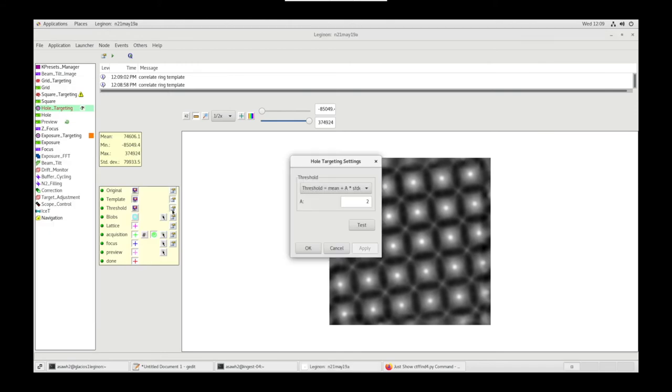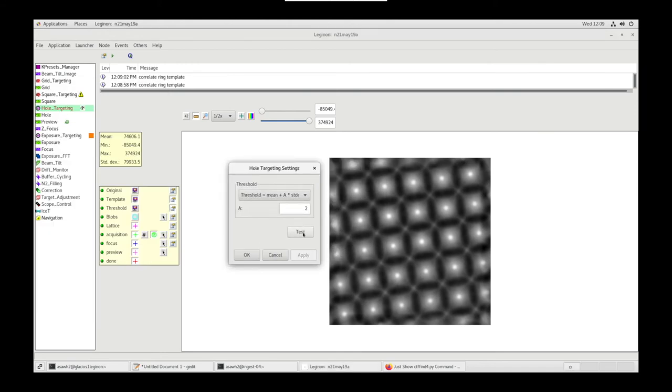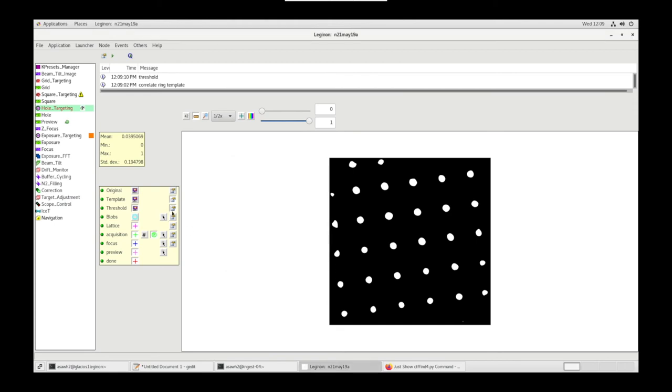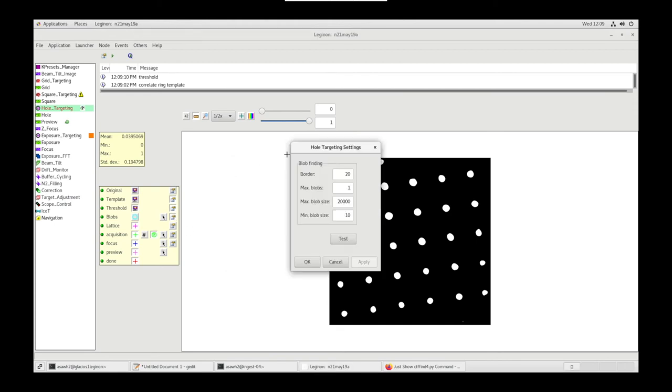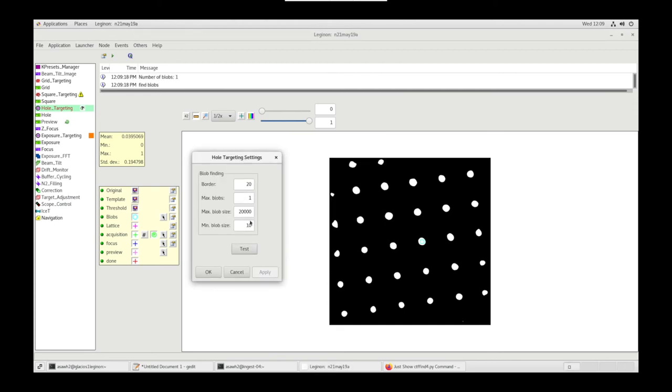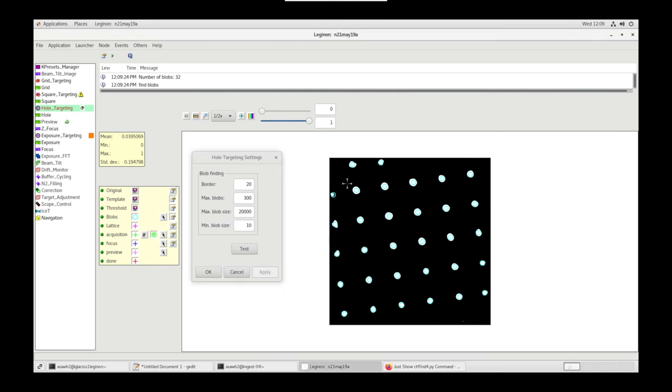Let's go to Threshold Settings. Let's test. Yeah, that looks good. We have Blobs. Let's go to Blob Settings and test. Let's increase our Max Blobs. Test. We can change our Minimum Blob Size and our Maximum Blob Size based off of the sizes that we want.